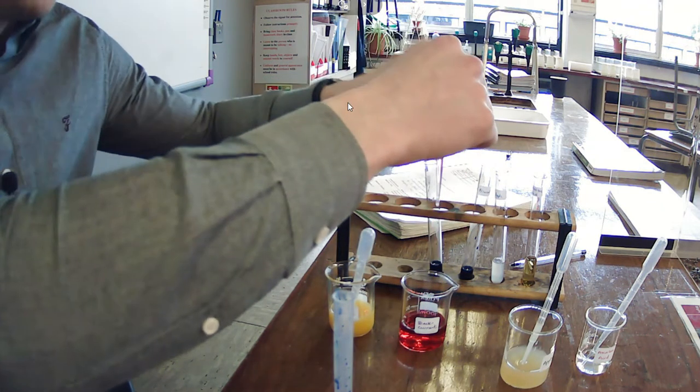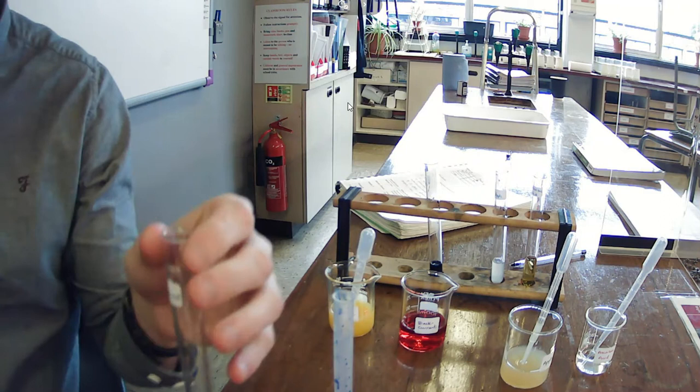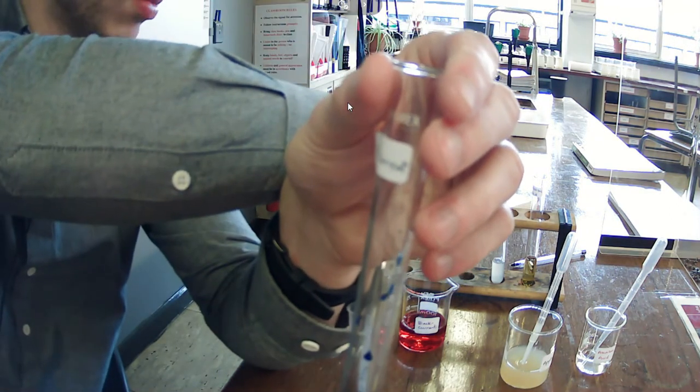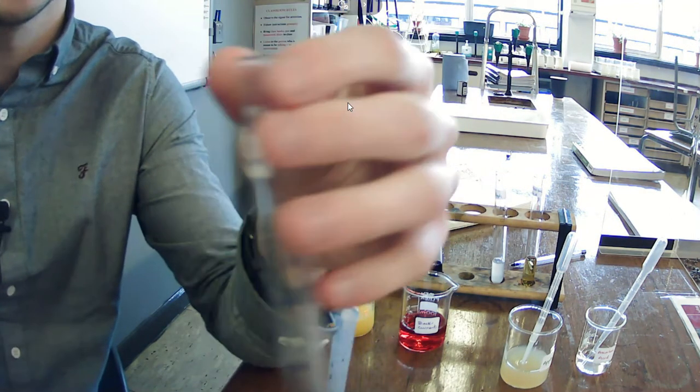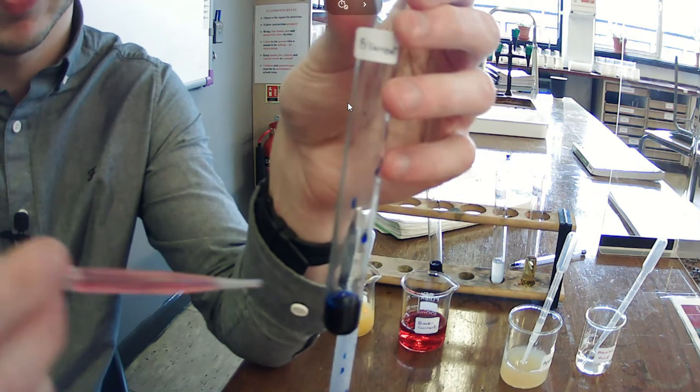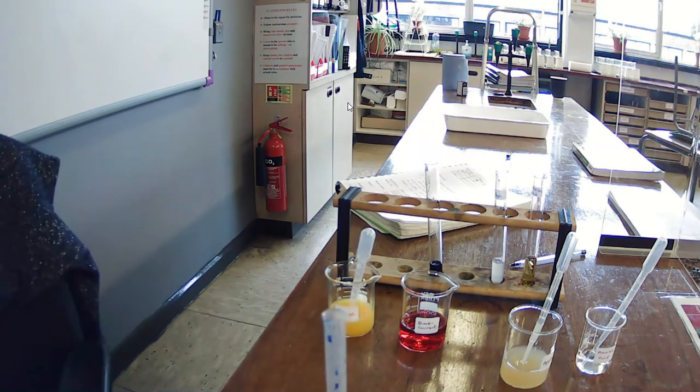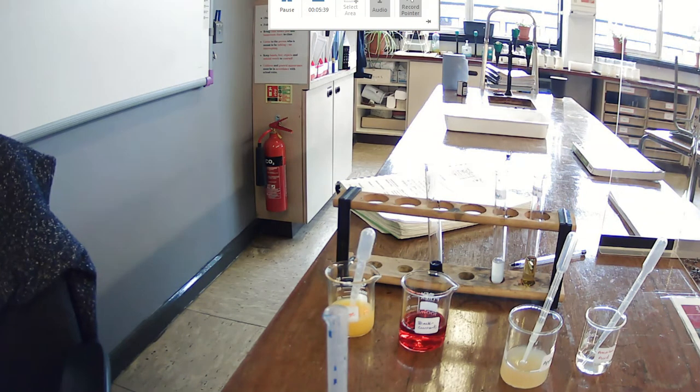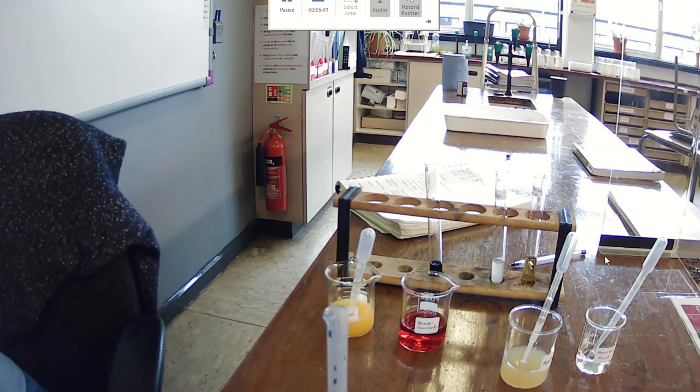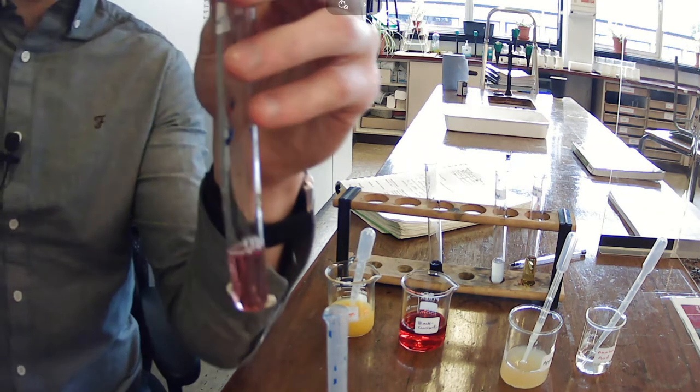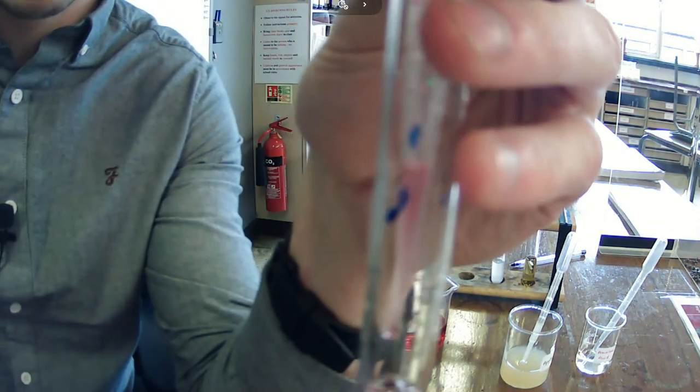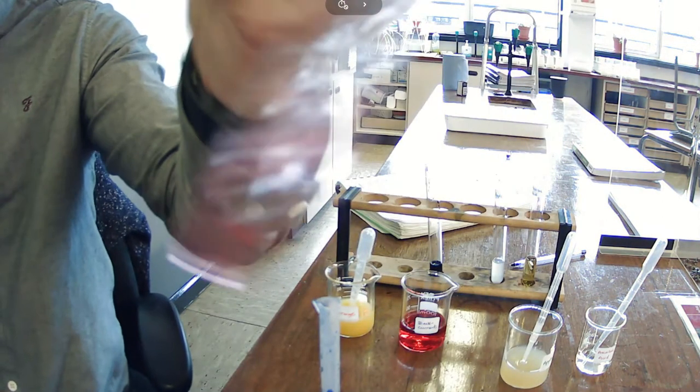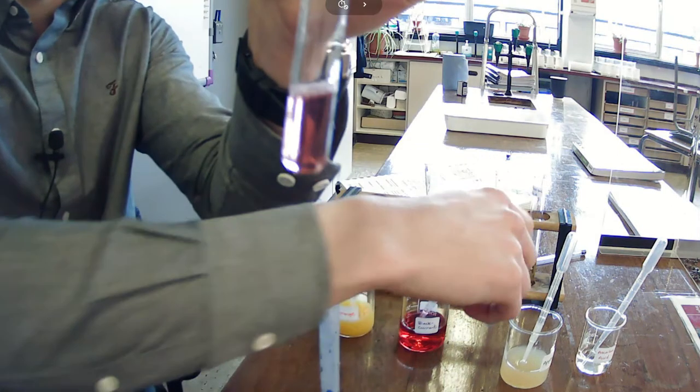So the next one we're going to try now is blackcurrant juice. And before we see the result, you may want to pause the video and think which has more vitamin C in it, apple juice or blackcurrant juice. Okay, so we're at 29, and maybe one more, 30. After 30 drops, so maybe to your surprise, actually after 30 drops, blackcurrant has turned to the color of the juice.